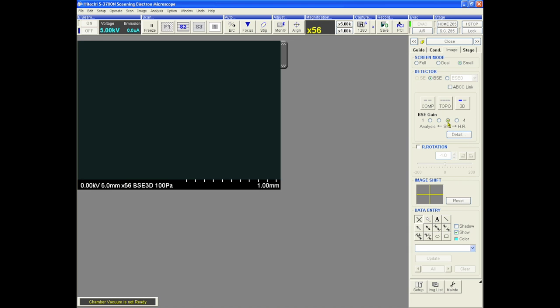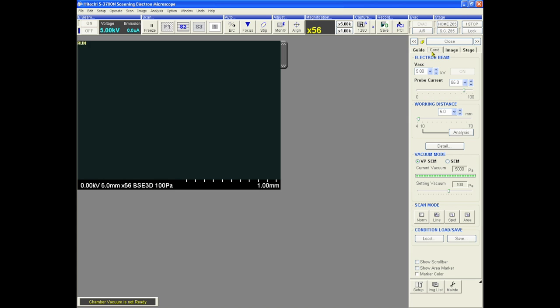Vacuum can be changed at any time in the VPSCM mode. Set a vacuum level that minimizes charging while maximizing resolution. Strong vacuum equals high resolution.